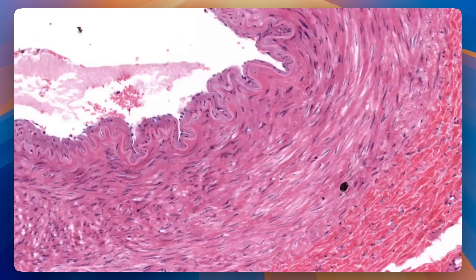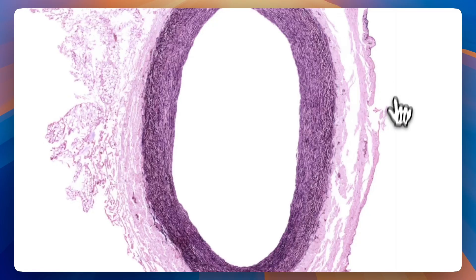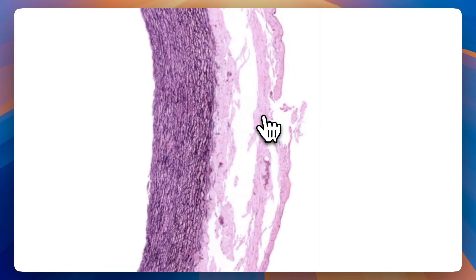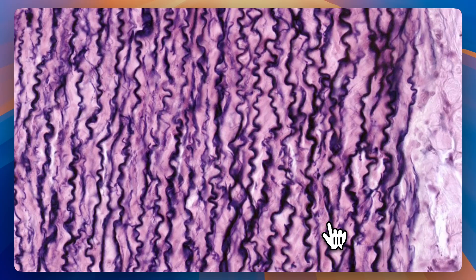The arteries that do have to stretch and snap — the largest arteries that are closer to your very strong heart — are going to be rich in elastic fibers, and you'll see it doused in them right away. Elastic fibers allow arteries to withstand quick changes in pressure during systole and diastole. So if you see what looks like a lot of lasagna noodles, a lot of elastic fibers, you're looking at an elastic artery.